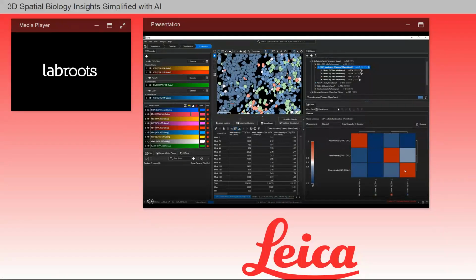In practical terms, the z-score is like looking at which clusters have the highest or lowest normalized value for a given measurement. And looking at this, we see 4 clusters emerging from this dataset. The first one is high in FOXP3 and low in everything else. Another is high in PDL1, one is low in everything, keeping in mind that the clustering also includes CD4 intensity that is not plotted here, which could mean that this is a conventional helper T cell, and one that is high in Ki67.